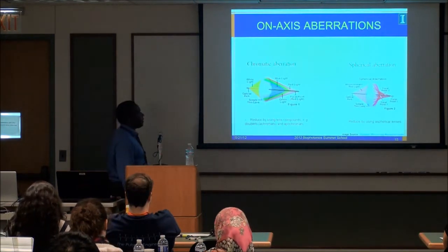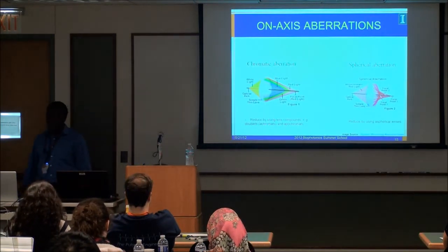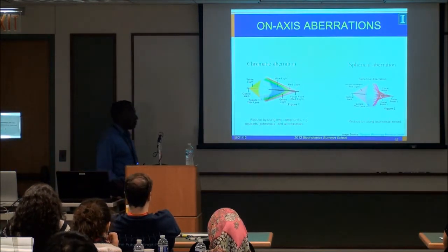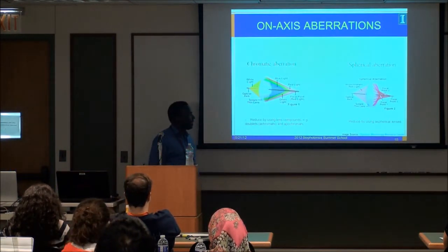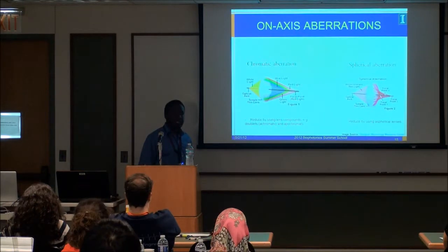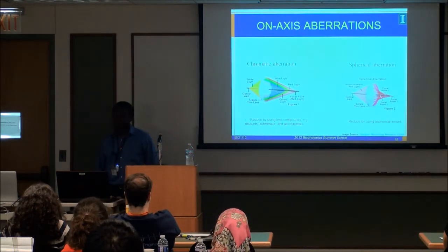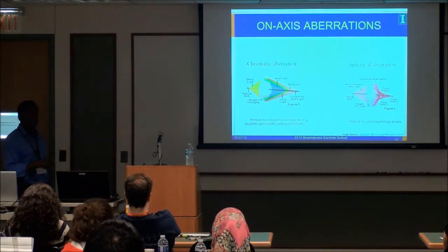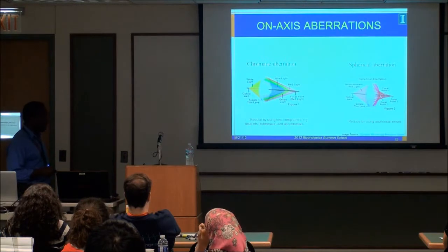All right, so now we can think of aberrations. These things are a bit of a pain. You see them a lot, sometimes because simply we don't align things as well as we could. Other times it's because the people who sell you the equipment weren't exactly forthright with the information about the stuff that they sold you. Either way, you'll see a manifestation of some of these effects occasionally.